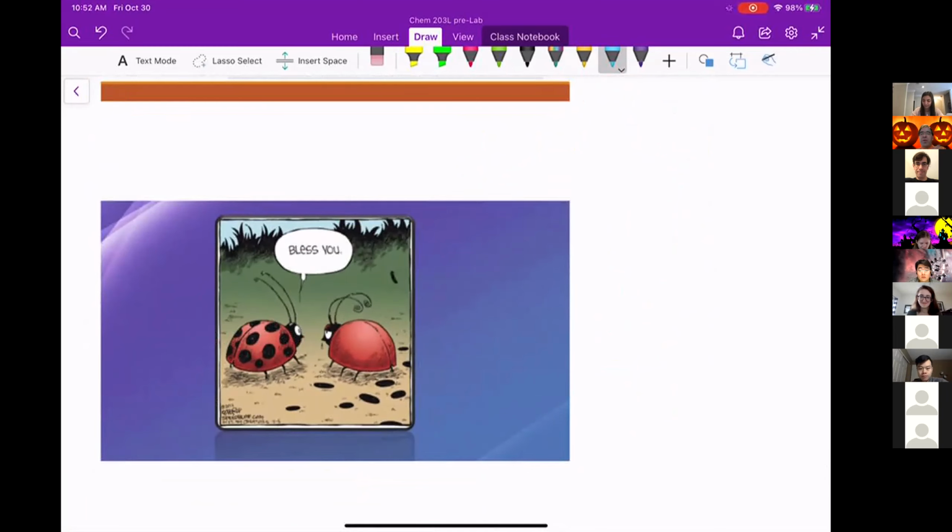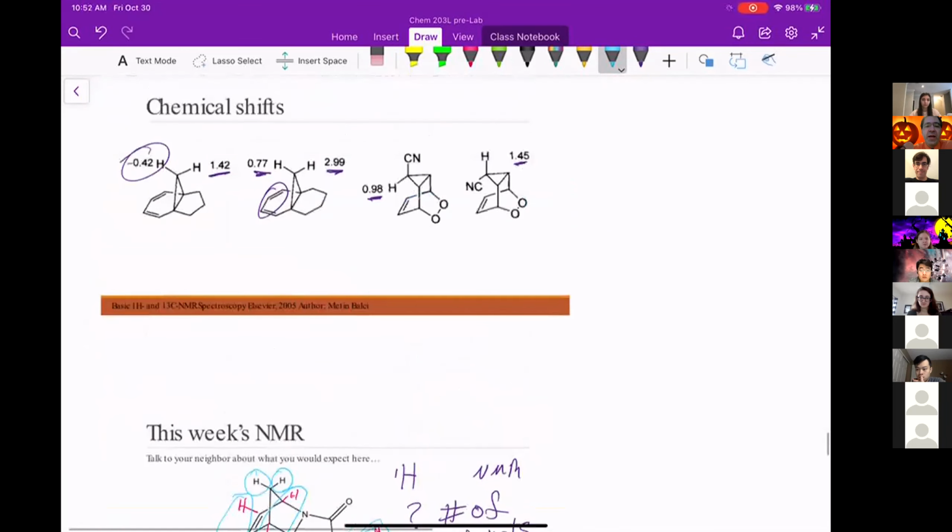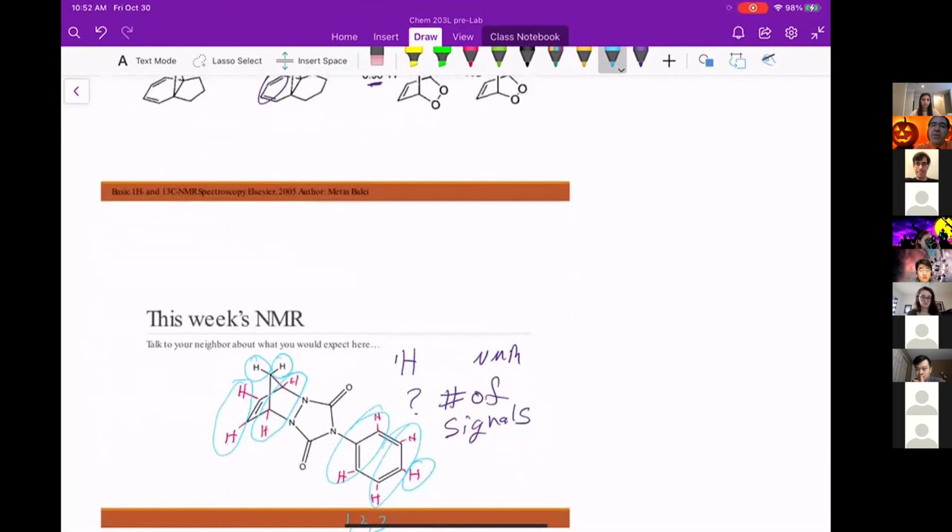So what did we talk about? We talked about some basics in Diels-Alder. The experiment itself is going to walk you through more about the Diels-Alder reaction, talking a little bit more about the stereochemistry of the diene. And then this week we're going to do this hetero-Diels-Alder reaction. Why is it a hetero-Diels-Alder reaction? It's because it's got these nitrogens in here. It's not all carbons.